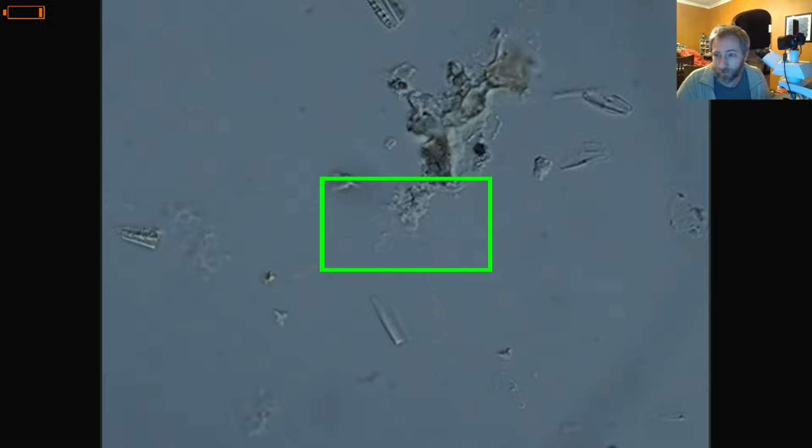Do these guys grow like a cone-like shell, like a mollusk? No, they do not. Diatoms will polymerize the silica all at once. They start to form the major structures, and then they build outward from those major structures, and then the diatom valve is complete. Snails grow every year by adding a little bit to the previous layer, and then the snail gets bigger and bigger through time. That doesn't happen with diatoms.